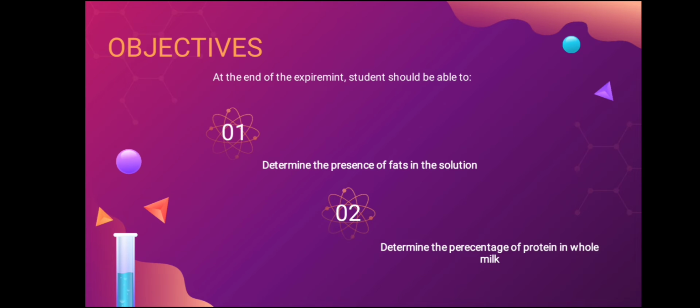For the objectives of this laboratory activity, firstly, students should be able to determine the presence of fat in the solution and to determine the percentage of protein in whole milk.